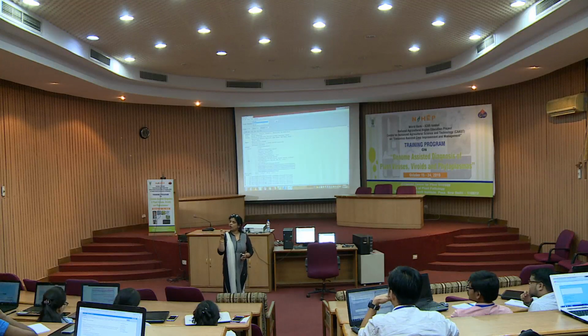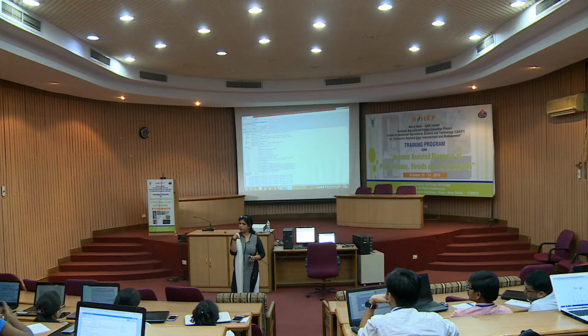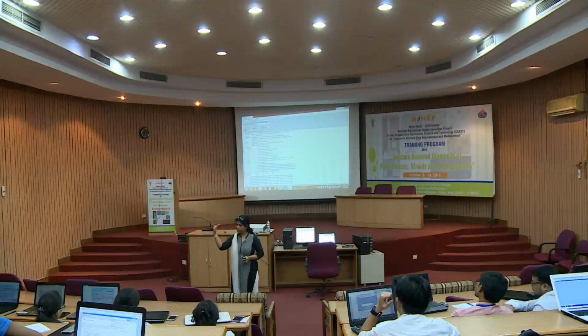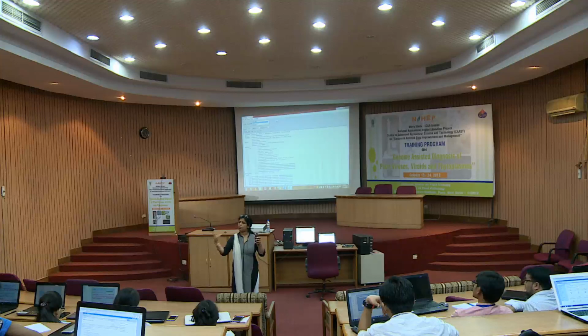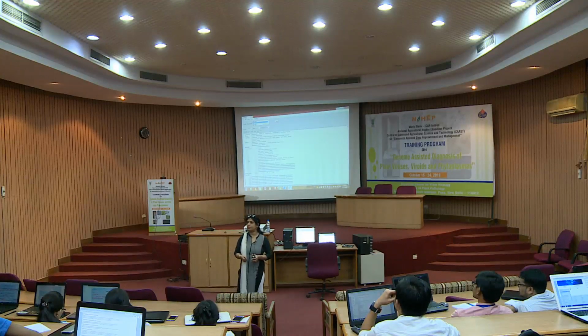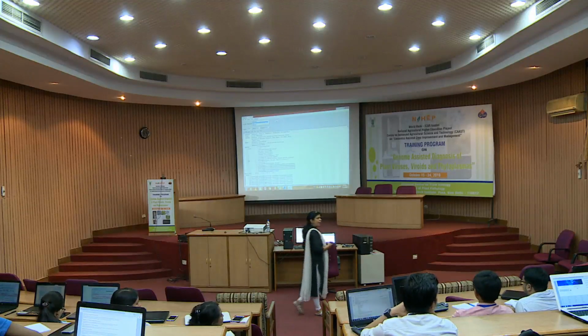Because it is a triplet of nucleotides that codes for the amino acid, there are 3 frames for each strand: 3 from 5 prime to 3 prime and 3 from 3 prime to 5 prime. All possible translates will be highlighted. If you study it a little bit, it will be clear to you. Any other questions? We are having 6 frames now.